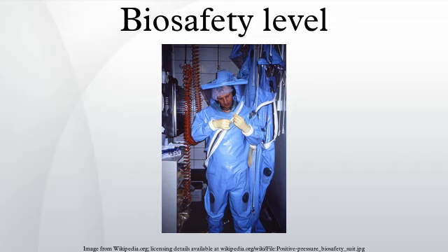All procedures involving the manipulation of infectious materials are conducted within biological safety cabinets, specially designed hoods, or other physical containment devices, or by personnel wearing appropriate personal protective clothing and equipment. The laboratory has special engineering and design features. It is recognized, however, that some existing facilities may not have all the facility features recommended for Biosafety Level 3.